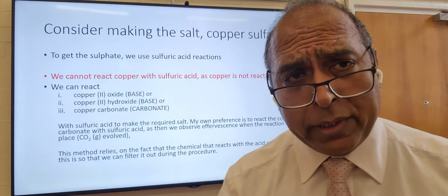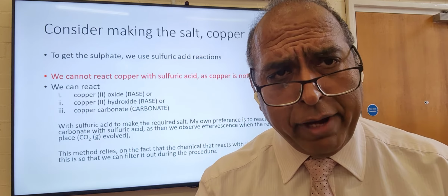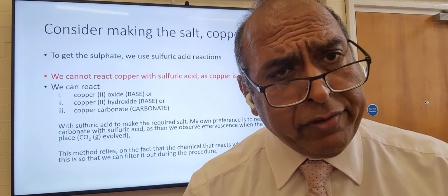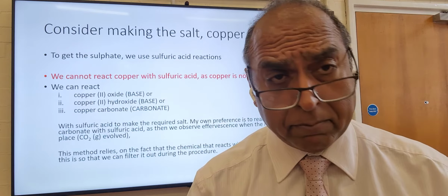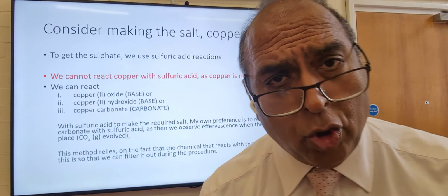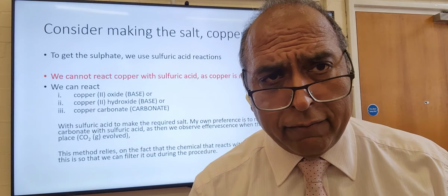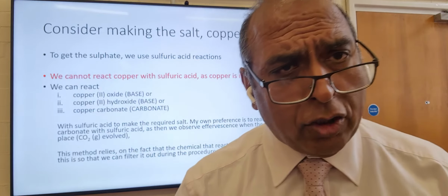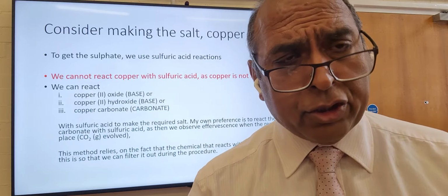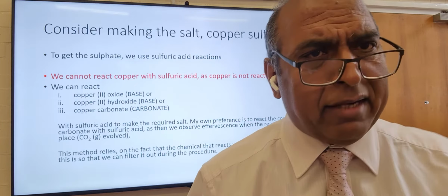And that is something we need to get our mind around. We need to know when these reactions have stopped. We need to react, definitely, all the acid away. If we don't react all the acid away, then it's dangerous because there's acid left over, and that acid left over will make the salt impure. So you get impurities and safety issues.